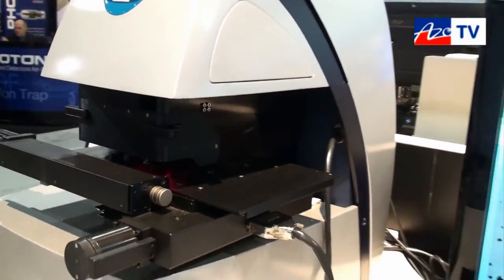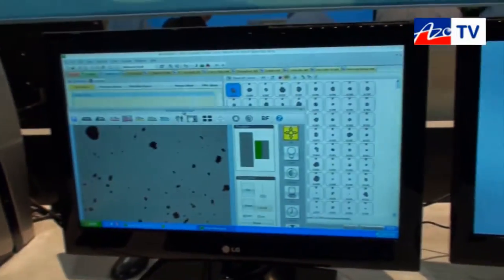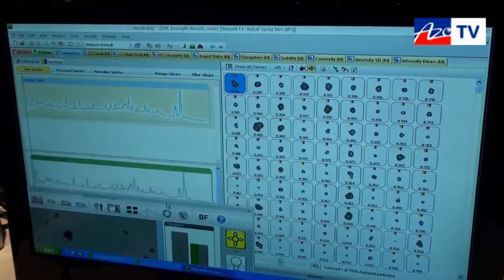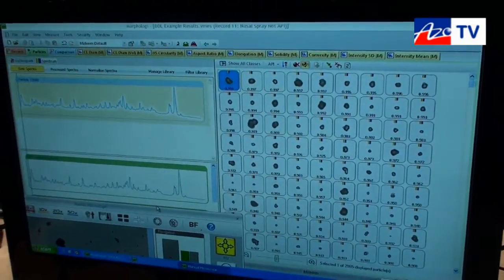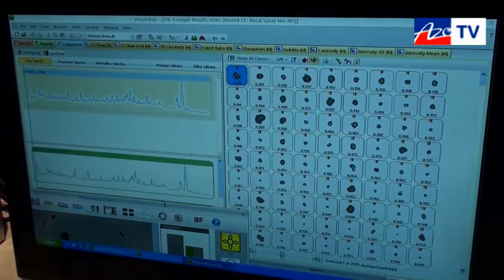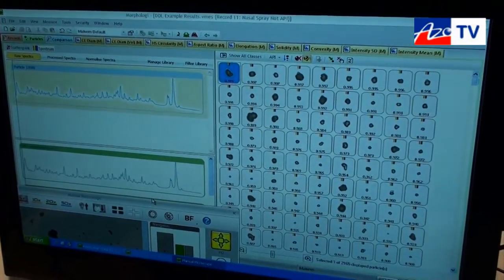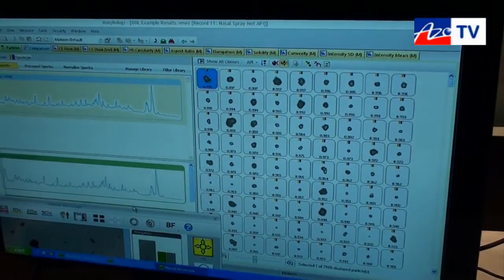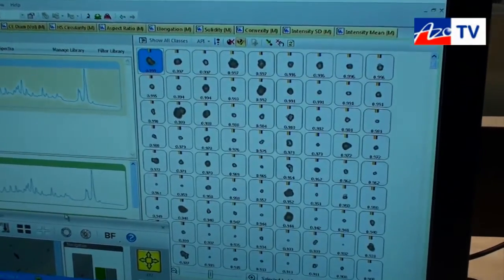We've been able to upgrade our front end on the software as well. What you'll see here is one of our more traditional views — quite a few different particles detected in an experiment. This is actually a dry powder inhaler that we've done in one of our development labs here in the U.S. We've taken individual images of each particle and identified exactly where they are in X and Y space.